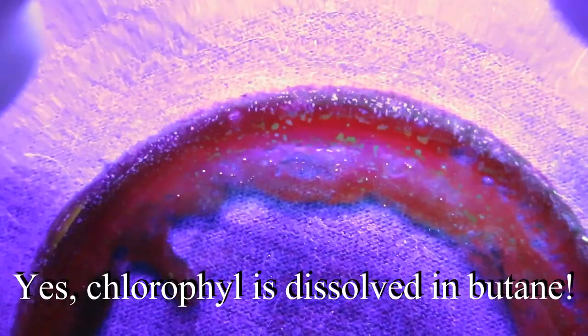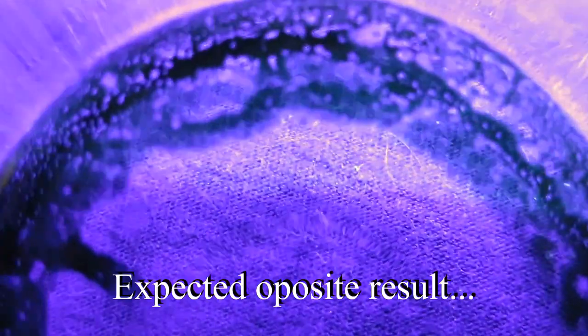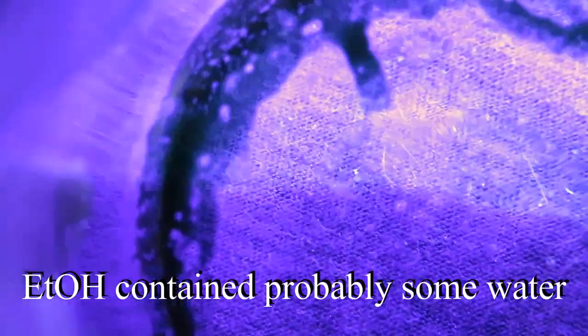So you can see this reddish fluorescence that is quite specific to chlorophyll. This is the butane fraction, even though you can see some orangey-green fluorescent blobs there.